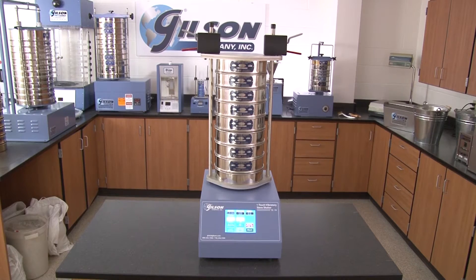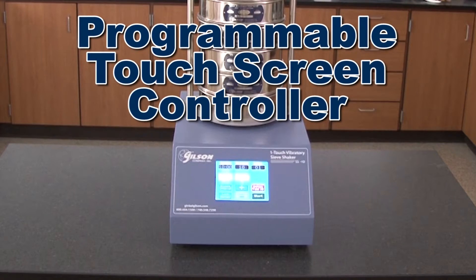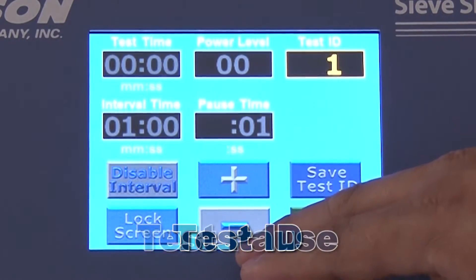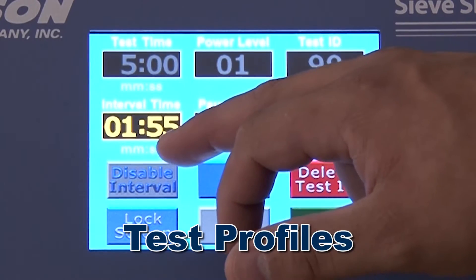To ensure optimum sieving performance, the Gilson programmable touchscreen controller allows users to select precise operational time, vibration levels, test ID, test pause, and the capacity to save up to 99 test profiles.